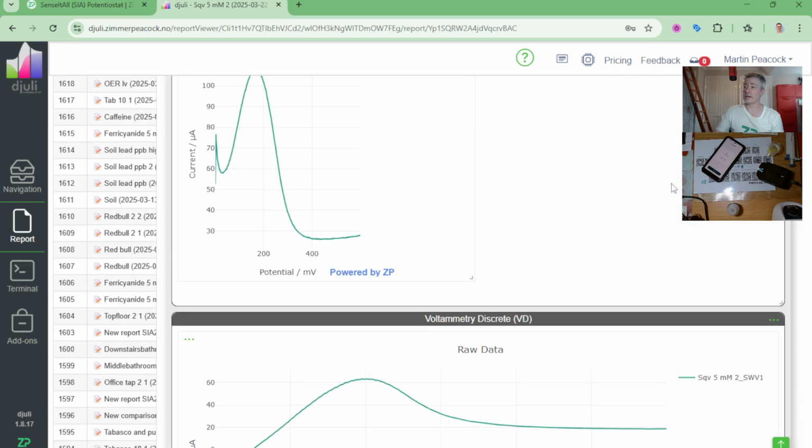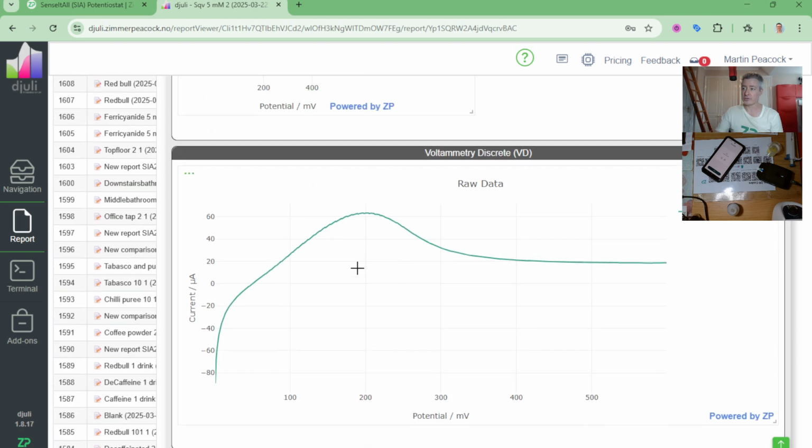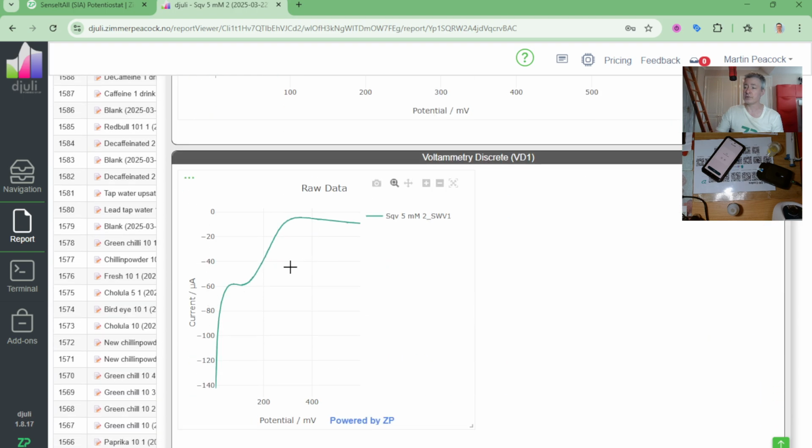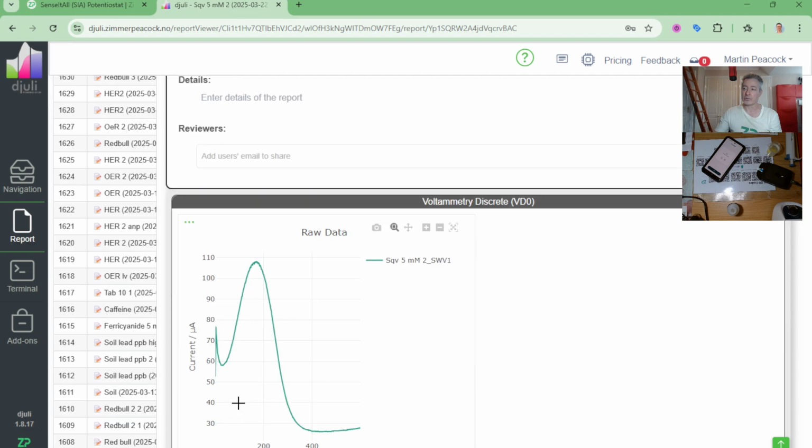So I can always go back and see. So I can see my difference signal. That's my forward minus my reverse. I can see my forward, and I can also see my reverse. So the difference is basically, I mean, it says it in the thing, it's the difference between the forward and the reverse scan, but it kind of tends to enhance my actual overall signal. So I got a really nice, clean signal there.